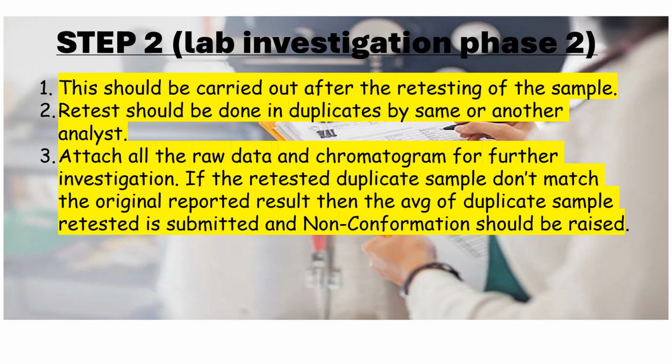The same analyst can do it or another analyst can do it, but it should be performed in duplicate. Now if the retested result is matching with the original result, then there is no problem. The results are reproducible and you have to report whatever result you obtained again, and submit it to the client. The problem arises when the retest is not matching with your original test result.